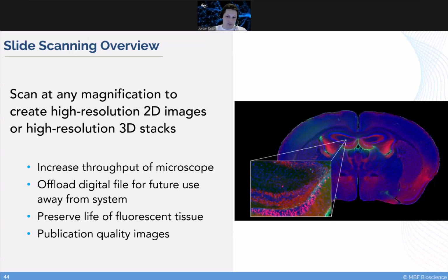Lastly, slide scanning can be used with a wide variety of research methods, including bright field microscopy, wide field fluorescence, as well as structured illumination and confocal devices. And today I'm going to highlight how to use slide scanning with wide field fluorescence.